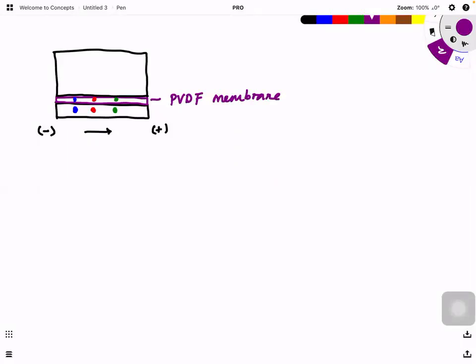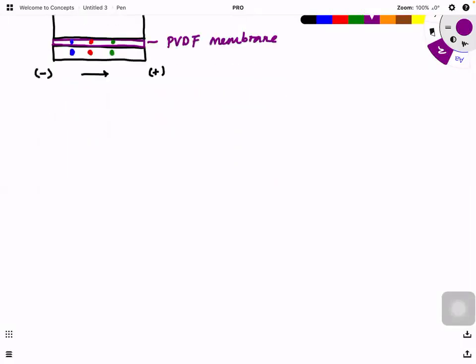Okay, so what we're going to do here is now, if you view it, you have the membrane already. This membrane is actually trapped with the proteins, the separated proteins. Now, I don't want to detect all the proteins. I want to detect, let's say for example, the presence of protein A here. What we're going to do here is very simple. We can go to the company and buy the monoclonal antibody that targets protein A.